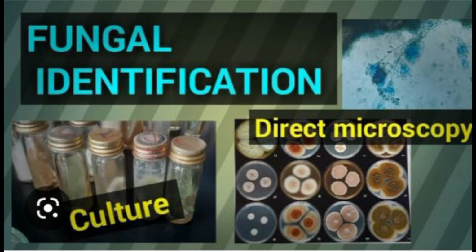Procedure: put a drop of Indian ink on the glass slide. Take yeast growth with the help of a wire loop and mix it in the drop of Indian ink on the slide. Gently put the cover slip over the preparation, taking care not to introduce a bubble. Examine the preparation under low power and high power 40x objectives of the microscope. Record your findings and report the observation. The presence of a clear halo around the yeast cells may be observed. The organism may be Cryptococcus neoformans.